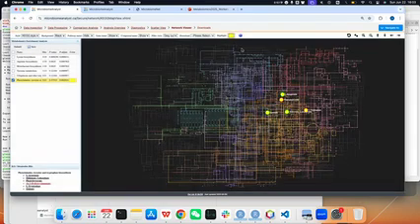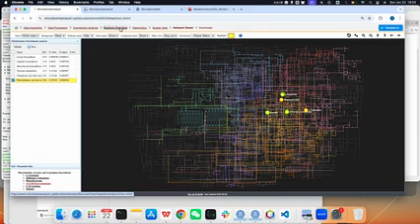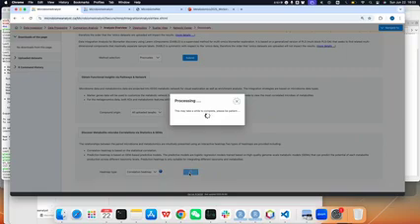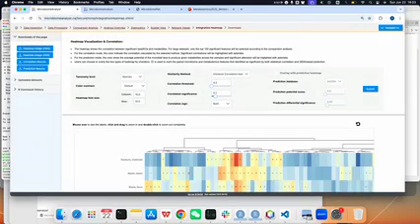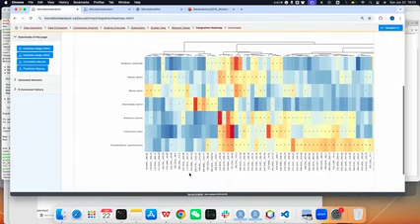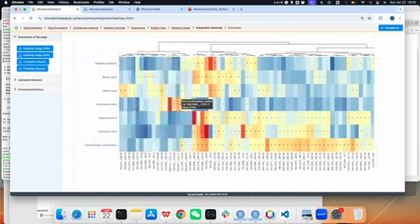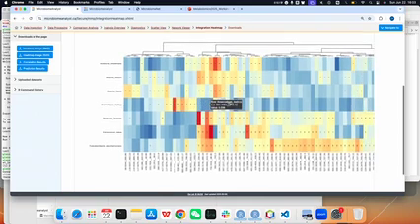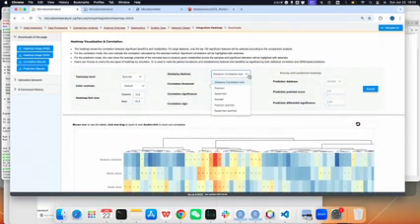Because this is a peak, we cannot do the prediction, because the prediction is only for the metabolites. This circle plot is actually similar to this correlation heat map of peaks and species, and you can see the stars here, which mean significant correlation. You can change different methods.